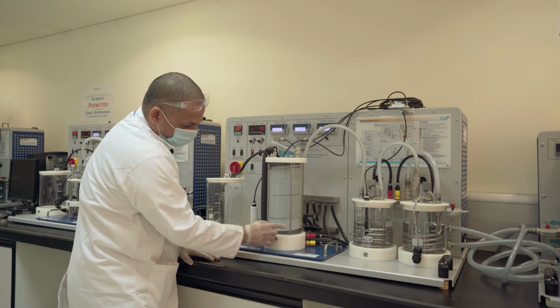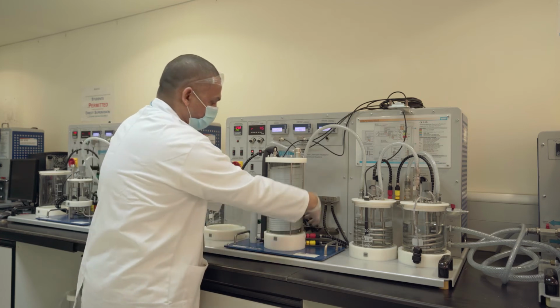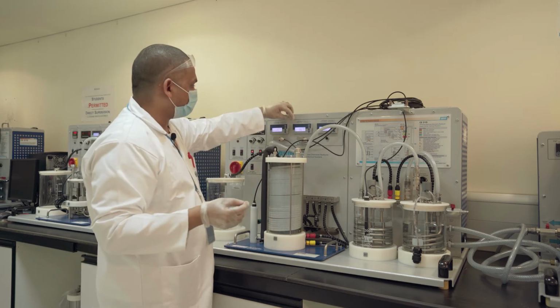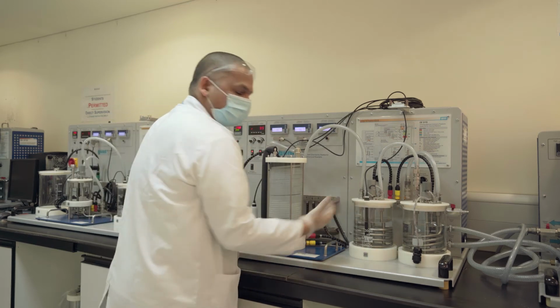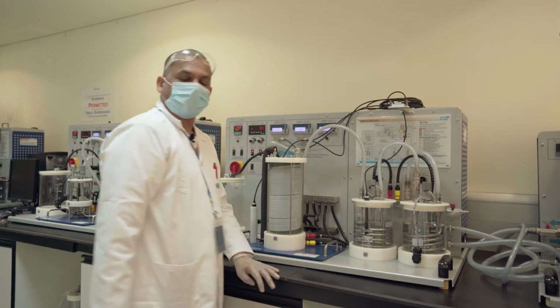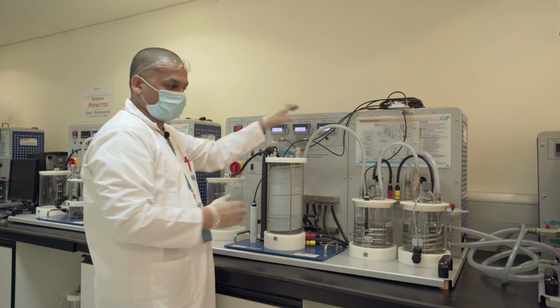You can see there are bubbles going inside now. Because the ethyl acetate and NaOH are coming here, getting mixed and then flowing through the reactor. So the reaction is taking place. By the time they exit, they will be in equilibrium. So we are measuring the conductivity at the outlet here, and at this particular flow rate and this temperature, I am measuring the final conductivity. Then later I can change the temperature of both of the feeds, and again allow it to reach a steady state and measure the final conductivity.